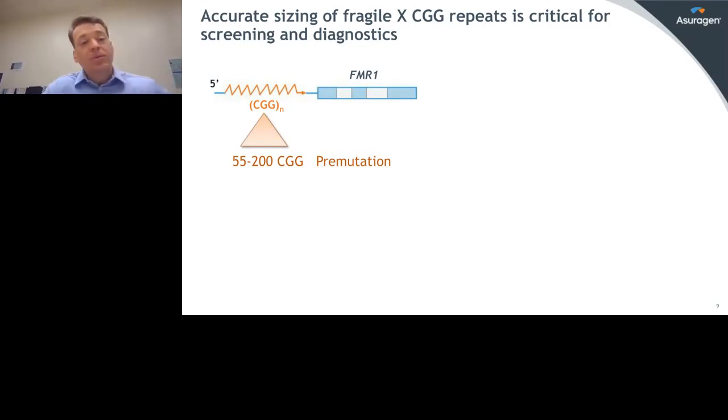One, you need to be able to differentiate true homozygosity in females from apparent homozygosity. In other words, it's advantageous to be able to have even single CGG repeat resolution so that you can tell the difference between a 29 and a 30 versus a homozygous 29-29, or a 29 that's heterozygous with a full mutation that using conventional PCR technology might drop out. In addition, because categorical boundaries are defined by a single repeat, it's important to have accuracy for the CGG numbers so you don't miscategorize the sample.